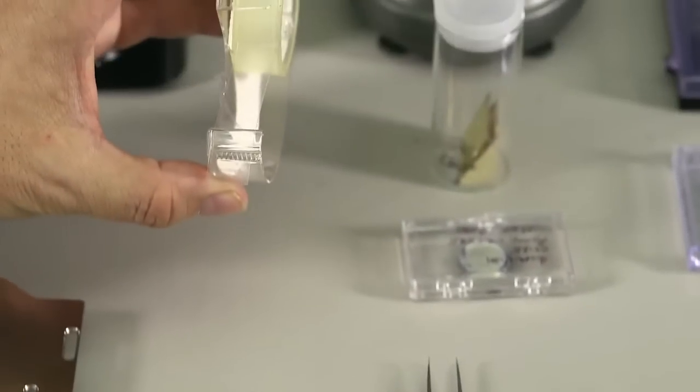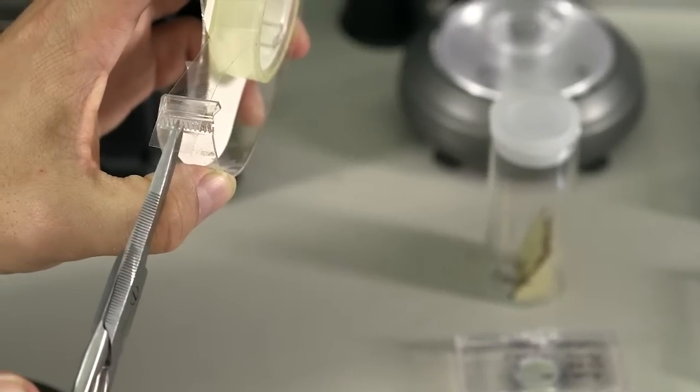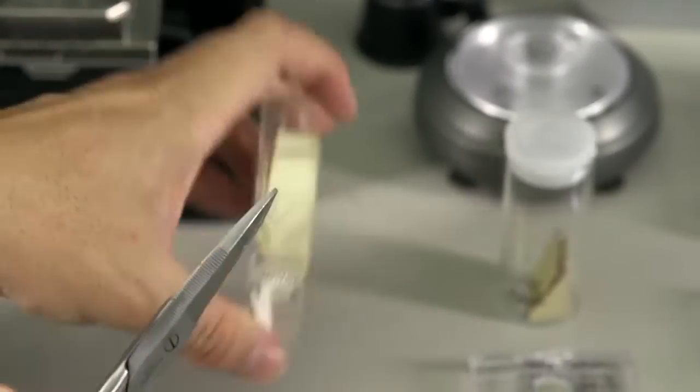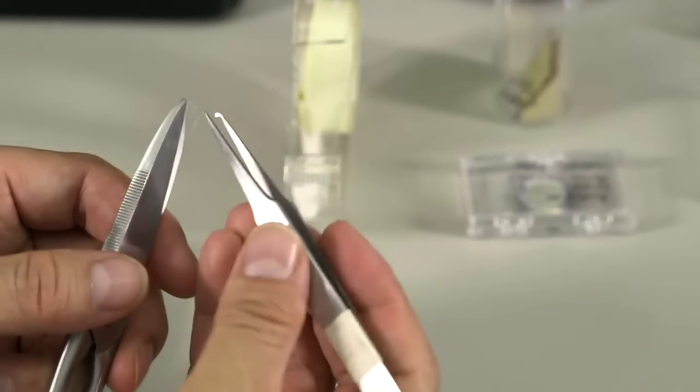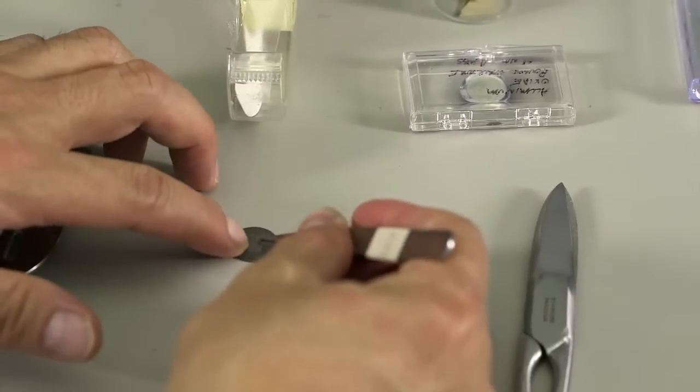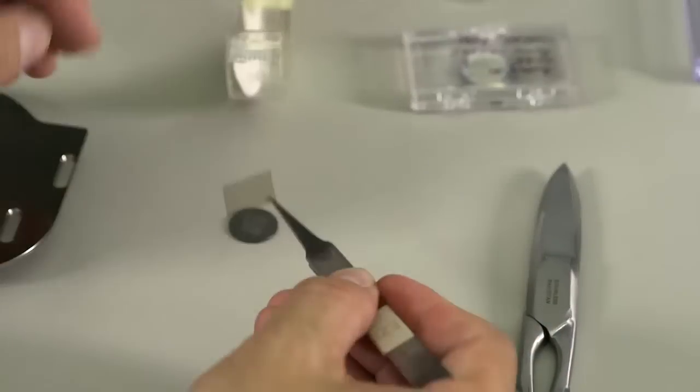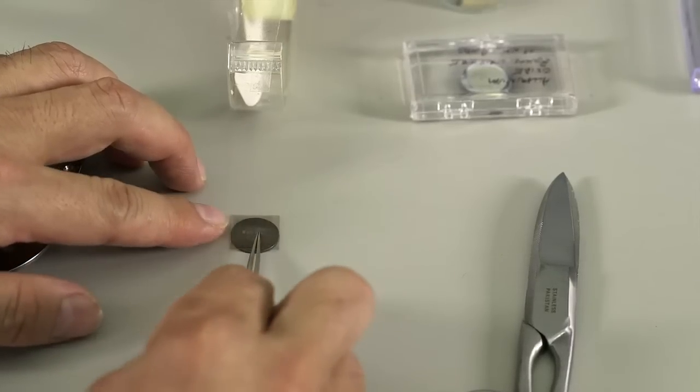First, you cut out a little square from double-sided tape. Put the tape in the center of the steel dish, and you can put your sample on top of the dish and apply pressure.